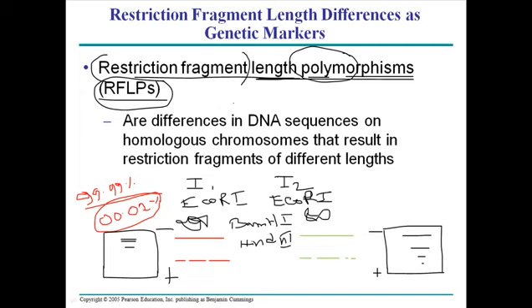No matter how closely we are related to each other, no two persons are genetically identical. They have some differences in their genomic content. This type of experiment suggests that, and we can determine it with RFLP technology, restriction fragment length polymorphisms. So remember, for example, if we need to distinguish between two different individuals, how can we do it? We can do it using restriction fragment length polymorphisms. We can take that DNA sample, cleave it with the same type of endonuclease, run it, and after the run we can find it.